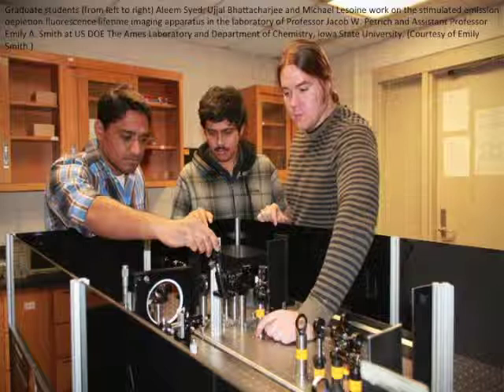So when you overlap those two profiles, you get stimulated emission, or you turn the fluorophore off at the periphery of the excitation profile. So you're collecting just the spontaneous fluorescence at the very center of the excitation profile, and those dimensions can be smaller than the diffraction limit of light. Spatial resolution in the tens of nanometers is possible. We've reported 40 nanometer spatial resolution with our imaging setup.